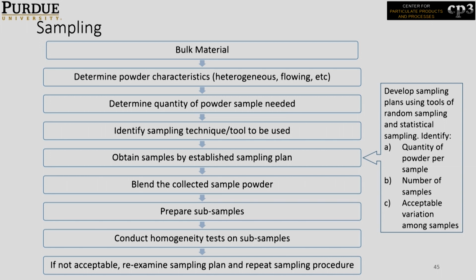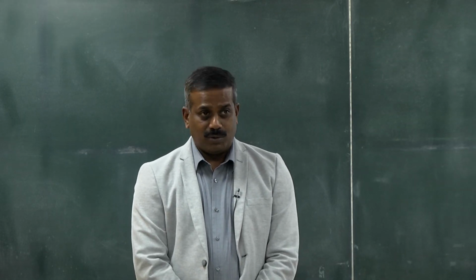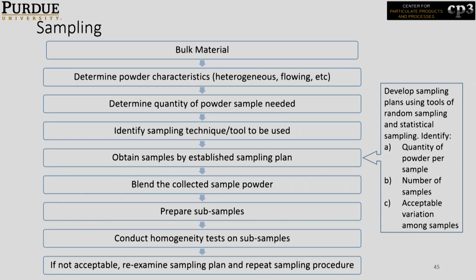Okay? If it's not homogeneous, if you see lots of variation, then you will have to redevelop your sampling protocol. Somewhere, the method or equipment or sampling system that you are using may not be very valuable. Okay.